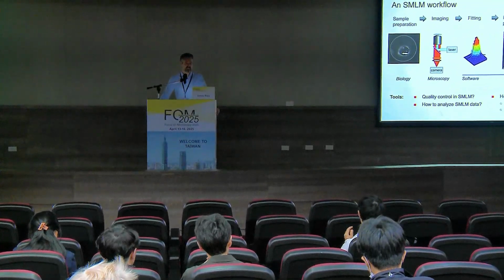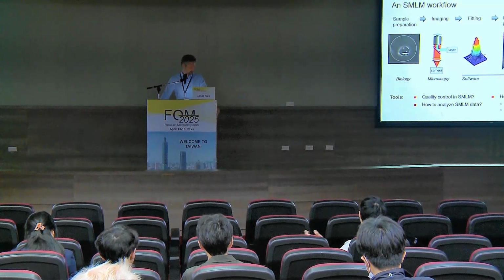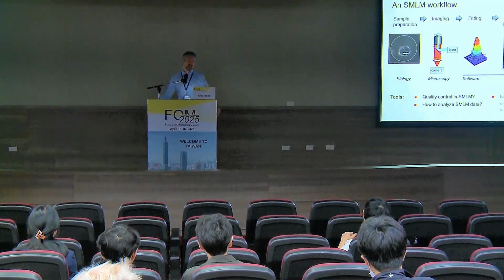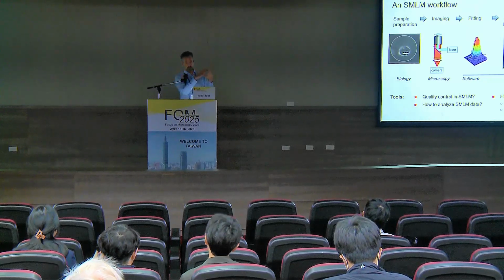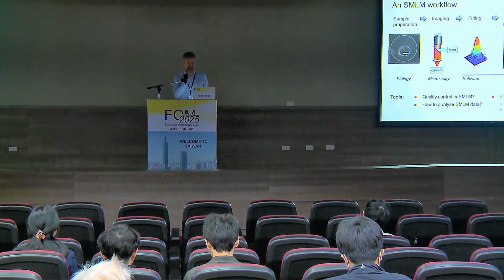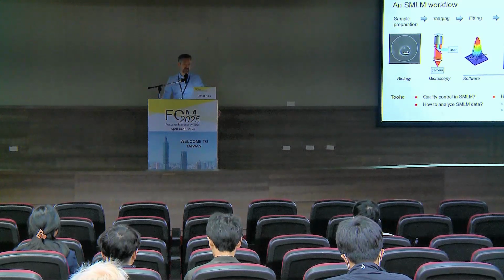Thanks. I have a question regarding DECODE. Can you use DECODE to train a model for other 3D engineered point-spread functions like double helix or tetrapod? Yes, of course, and we did this in the paper. And also here, I think it is advantageous to use deep learning, because often when you have something like a double helix point-spread function where you have the 2 lobes, you easily get overlapping point-spread functions, because you have 2 lobes here, 2 lobes here. And with single emitter fitters, you have to go to ultra low densities to properly fit them. And with DECODE, it doesn't matter. As long as it's not super dense, you can have these overlapping point-spread functions, and it still localizes and detects them properly. Thank you.